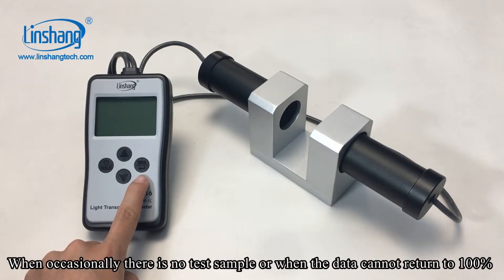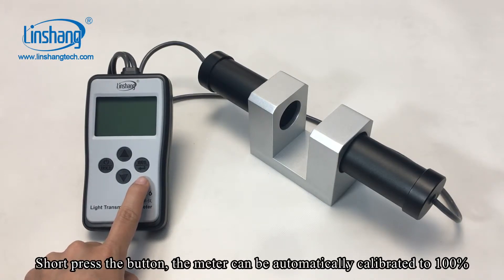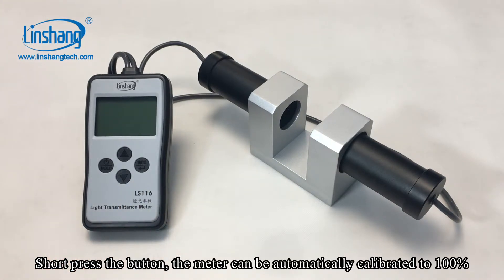When occasionally there is no test sample, or when the data cannot return to 100%, short press the confirm button and the meter can be automatically calibrated to 100%.